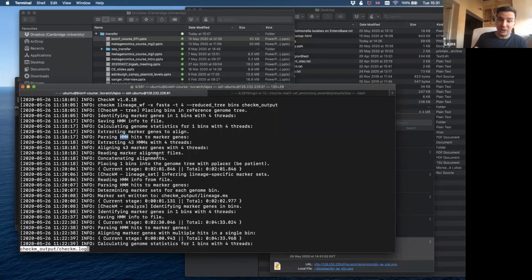So if you sequence your colony because you want to characterize all the genes in it, you want to find metabolic pathways, and you want to find complete metabolic pathways within your genomes, then you have to aim for very complete, 99%, 98% complete genomes. The second thing is, how many of these 43 genes were found only once, or how many were found multiple times?